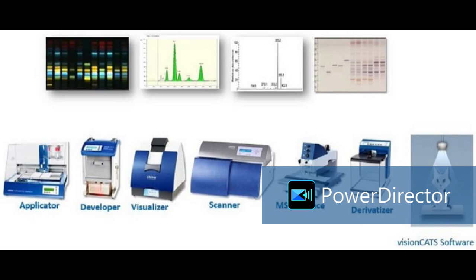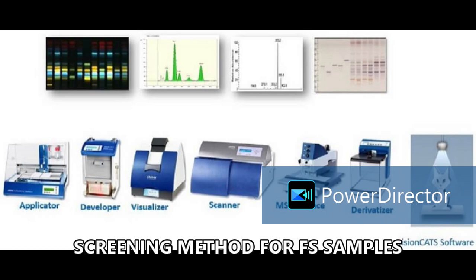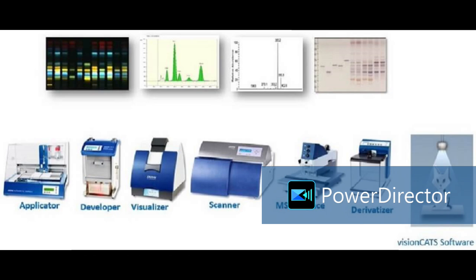Then a screening method for identification of forensic drugs. Different forensic drugs like ketamine, psilocin, codeine, heroin, methadone, meaning different kinds of street drugs as well as poisonous drugs, or we can say forensic drugs.